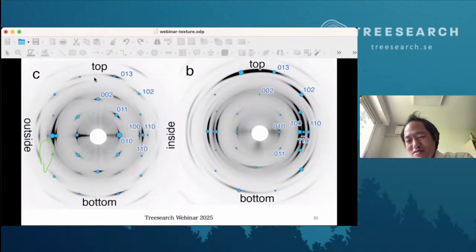And you also see that with the X-ray beam parallel to the membrane, in both cases, the z-axis is roughly vertical, but you have more misalignment if you look with the X-ray perpendicular to the film. So you have different aspects of the orientation. But the main point here was that we can directly deduce the chain polarity just from a few X-ray diffraction patterns.